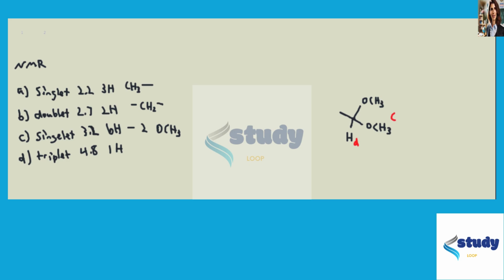That would look like this. The chemical shifts would account for these protons being alpha to this ketone, and the integrations make sense, and the splitting patterns make sense. So let me go ahead and fill them in.